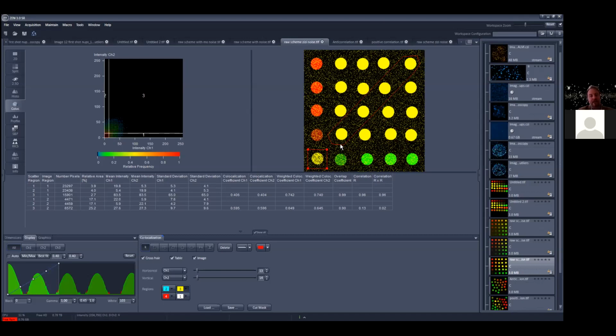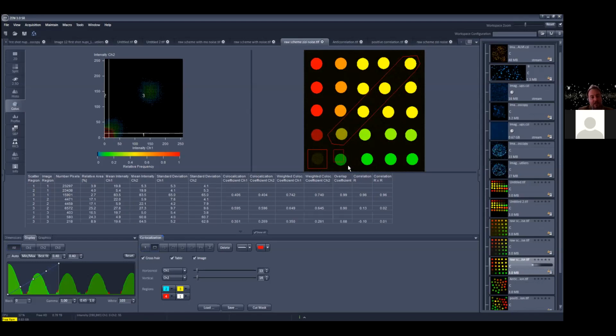If I have different objects marked here, I have to remove this thing so that you can see it. If we have this diagonal marking here, this will be the image region number 111 and the quadrants 1, 2, 3. So it's going to do the correlation over there. This box here is the next set of elements in the table, and I can add another one, for example, here for those guys. And similarly here, it is going to do the correlations and everything for the objects, if I select them on the left or on the right side. Okay.